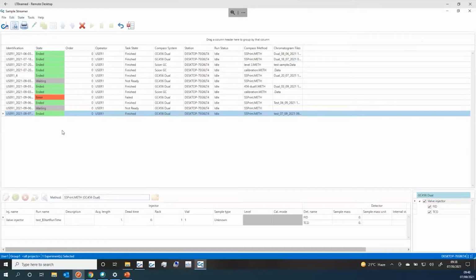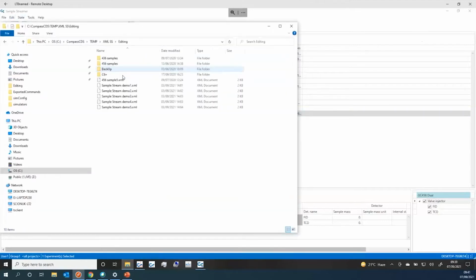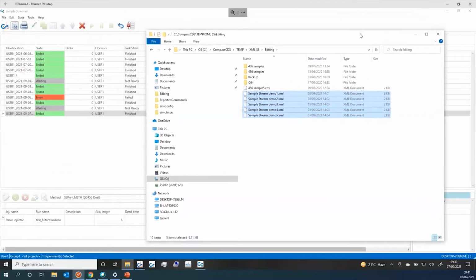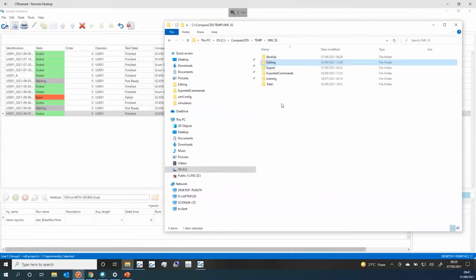If I wanted to use it in a LIMS mode, just to let you see that operating, I've created a few XML files that I can drop in the correct folder to let you see these showing up in Sample Streamer. So if I just copy these, and I'll just move this off to the side so that when I put them in, because it does happen quite quickly. One of the things about computers we all know is they do things fast.